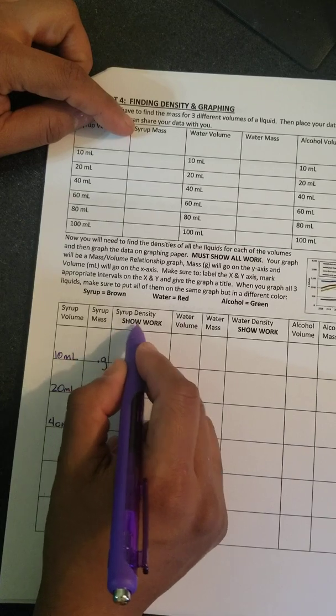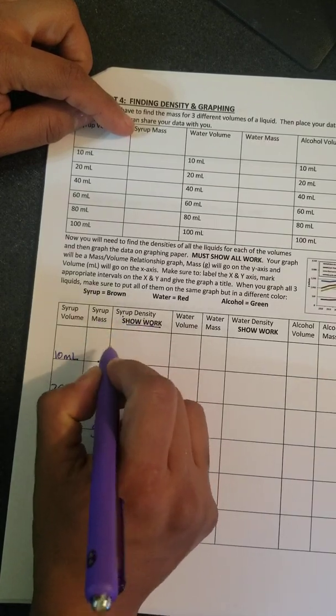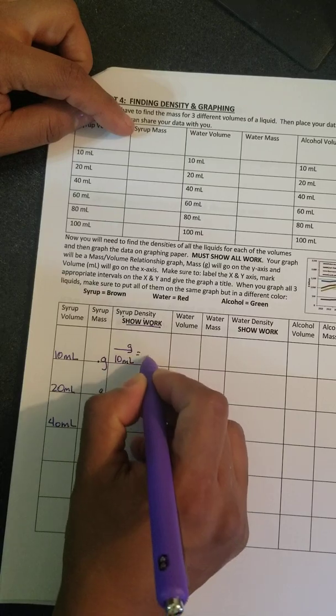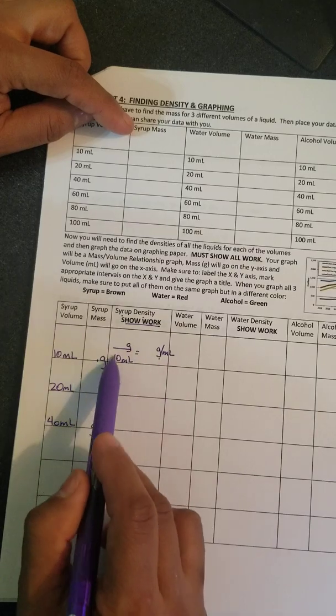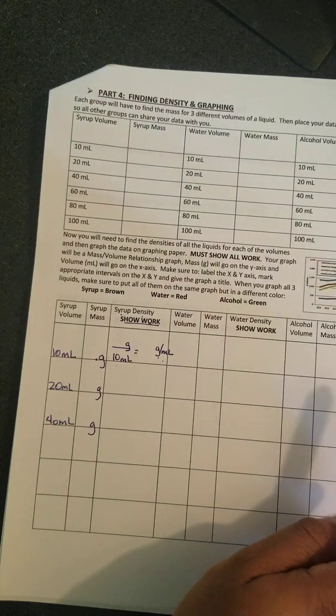Then you're going to show your work, and what is the syrup density? You're going to get the mass, which is the number we just don't know yet, over the volume, 10 mLs, equals your density, which is grams per milliliters. Right? Please don't forget your units. They don't cancel out.